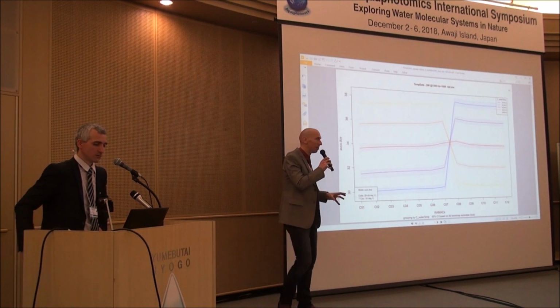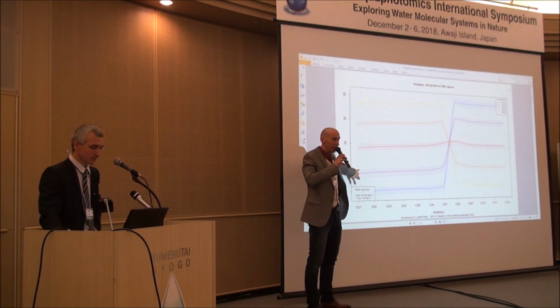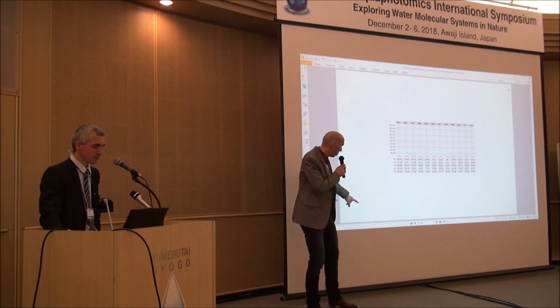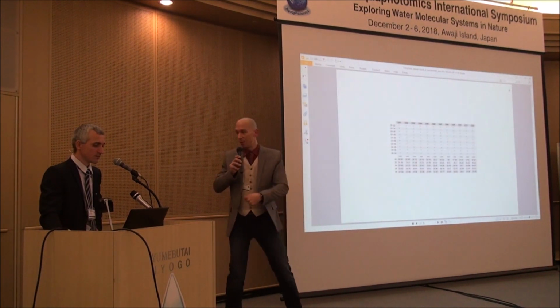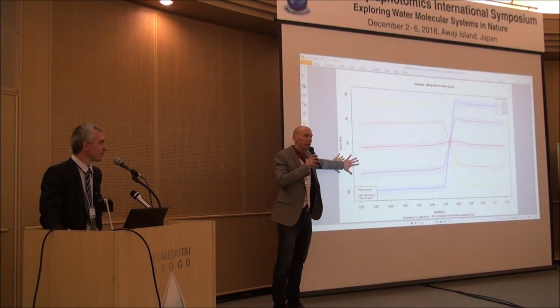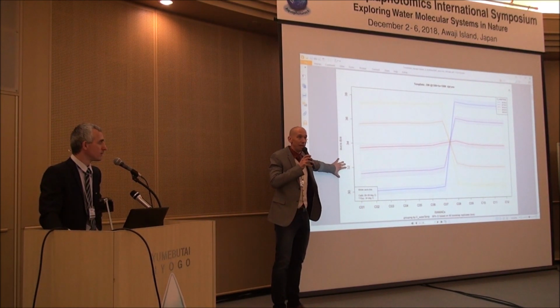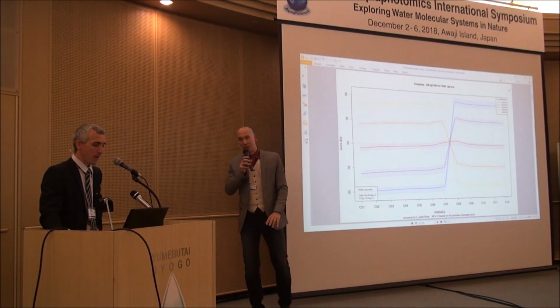And we have confidence intervals. So if we have enough samples, we really can see at what wavelength something is significantly different from the rest. If you go back one. Yep. So this is very important, and I really would like to ask you to please study this, and if you want to use it, familiarize yourself with it.